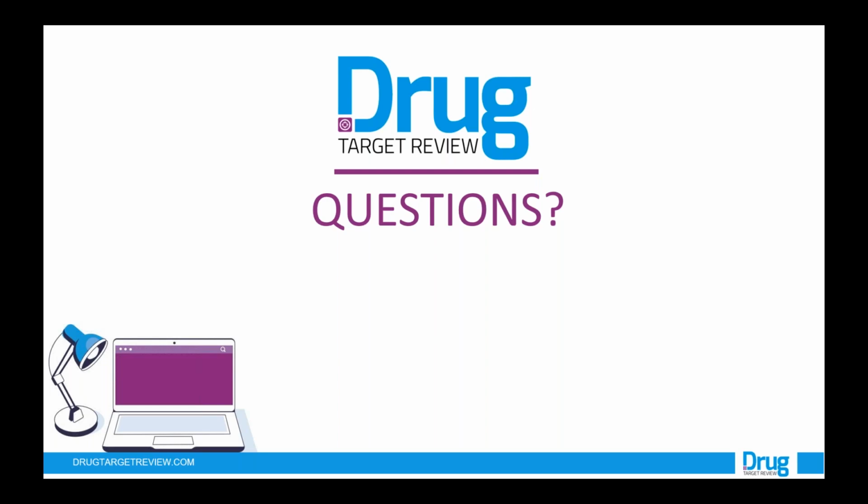Thanks both. Just a follow-up question, Paul. Does destabilization suggest target engagement? To my mind, I would say it does, because in the experiment we're looking at the ability of a ligand relative to the vehicle to induce a change in the assay, which is reflective of a change in the target protein. So yes, absolutely, it would indicate that the compound has engaged the target, which in turn indicates specificity, affinity, and access to the target, or in other words, cellular permeability.